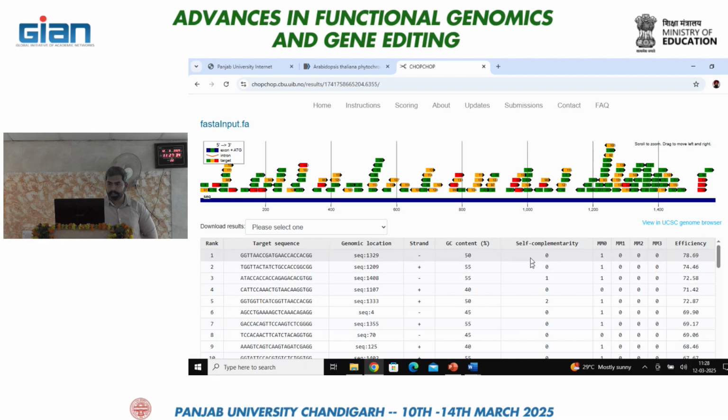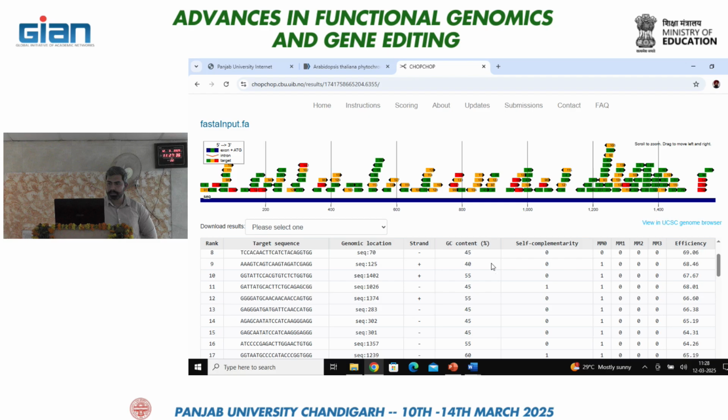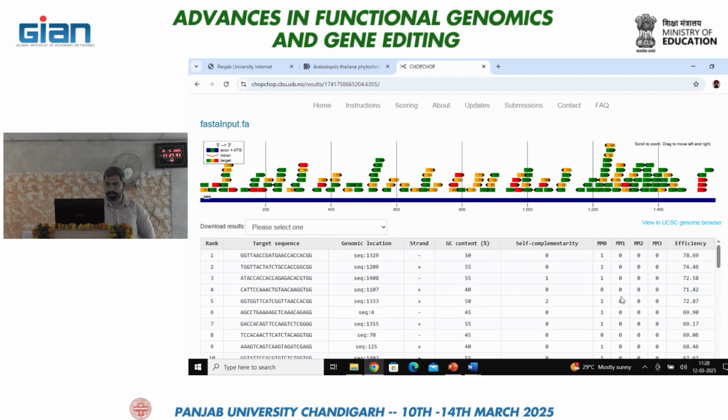Because there are other parameters as well, like the mm0, mm1. The list is not like that. The top target sequence you get, you can't just simply use, because there are other factors as well. These are mismatch numbers: mismatch 0, mismatch 1, mismatch 2 and mismatch 3.